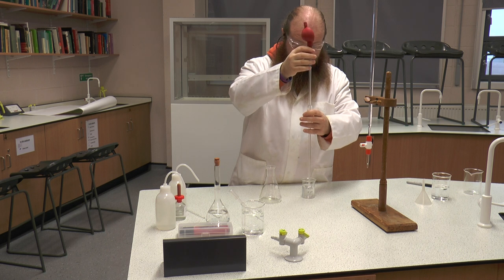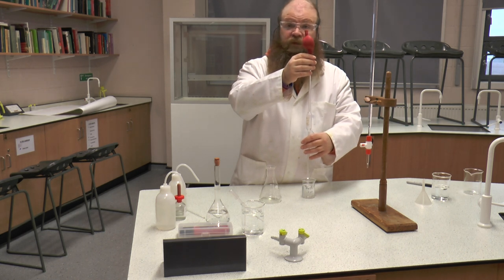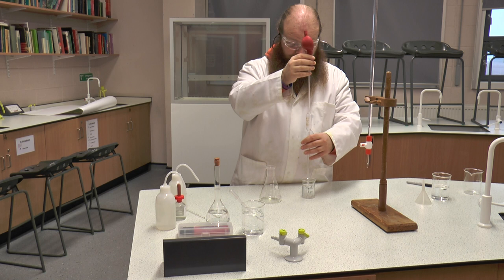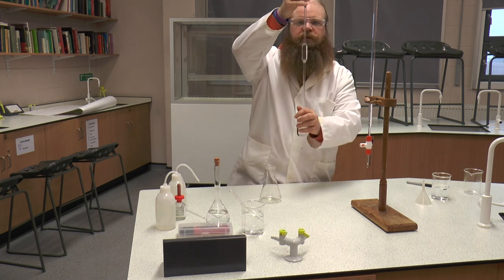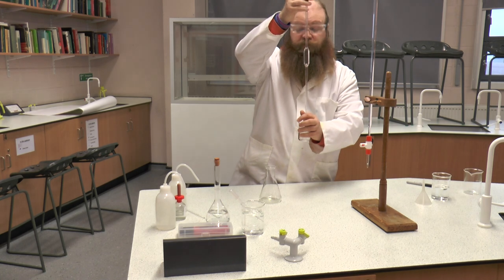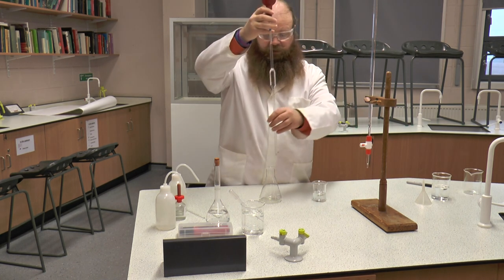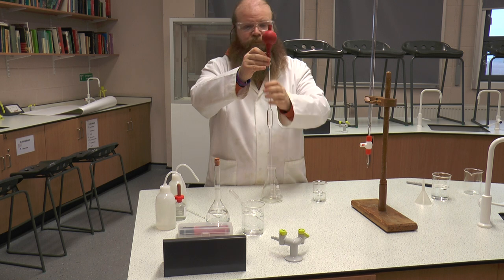Once we squeeze the air out, we then very carefully place our pipette into our solution. The pipette needs to be below the top level of our solution but not touching the bottom. We're then going to draw up our solution using the pipette. If the pipette stops sucking, it means that we'll need to squeeze it again and push more air out. Once again, we're going to very carefully make sure, by putting it at eye level, that our meniscus — the bottom of the meniscus — is on the line, which it is in this case.